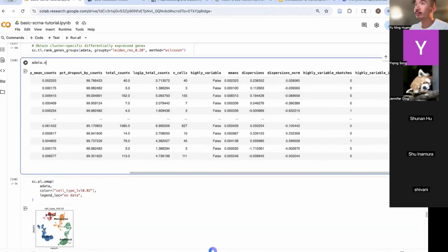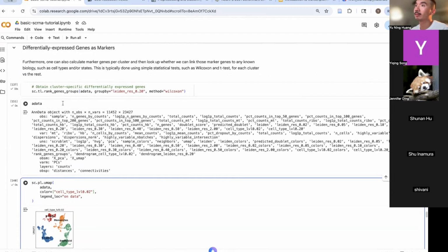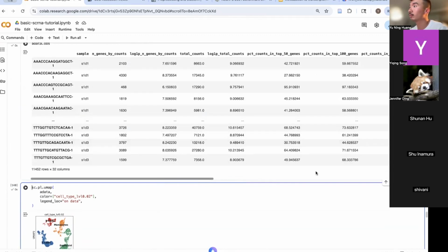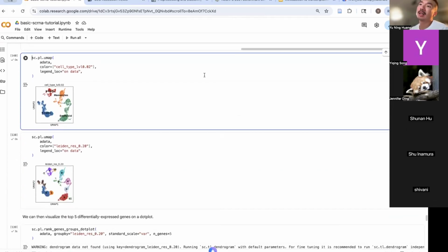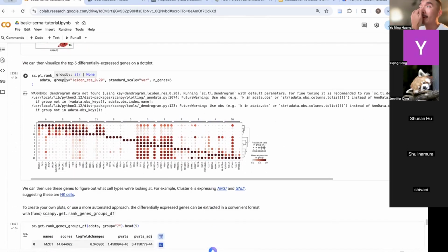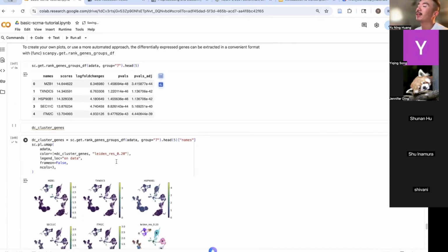So, did they have any? Oh, wait. Yeah, okay, they didn't. So I'm using the top ranked genes at this column over the resolution, the cluster identified at 0.2. So that's why I think it looks a little off if I do 0.2.